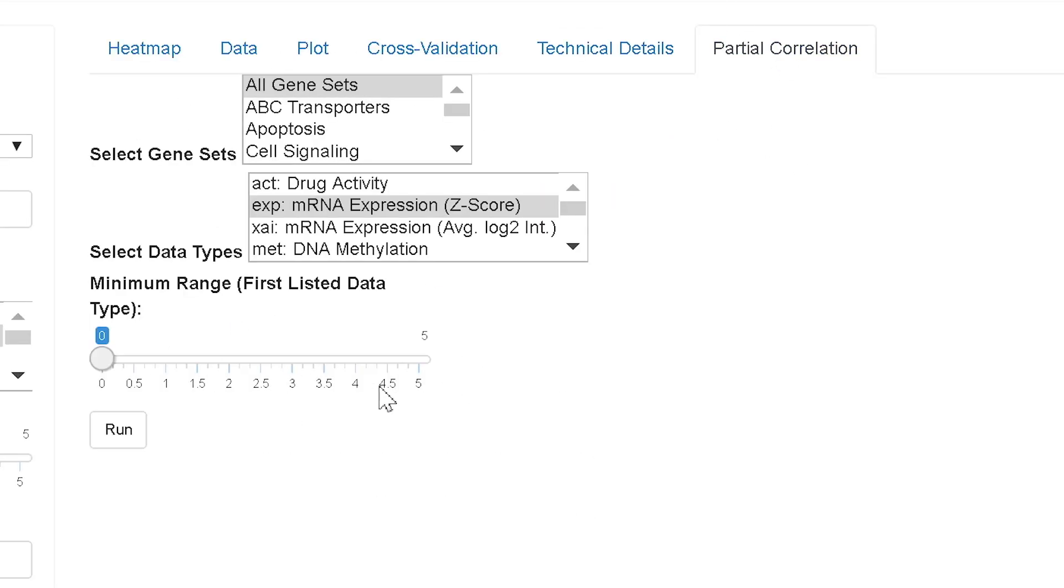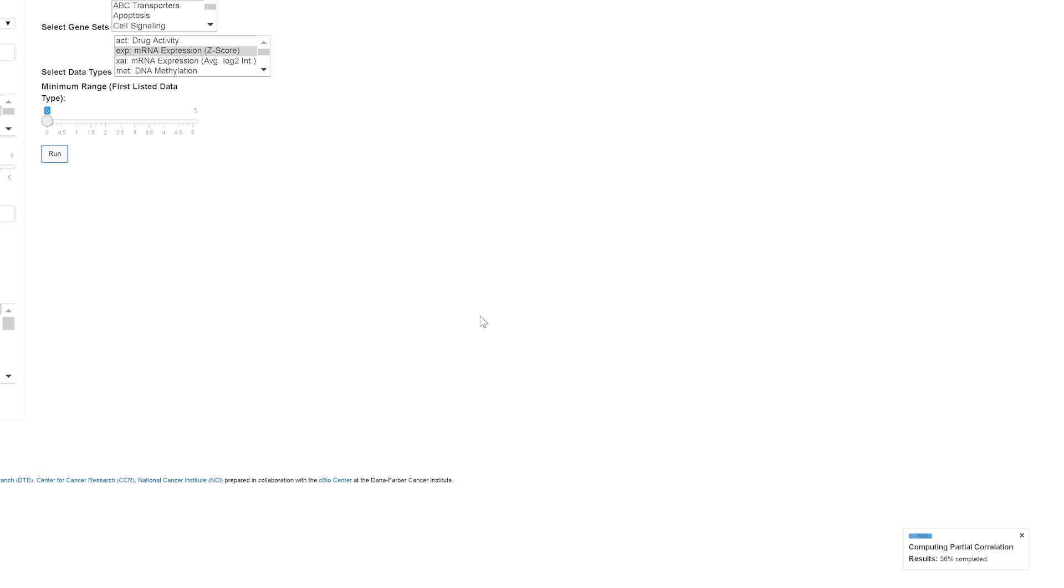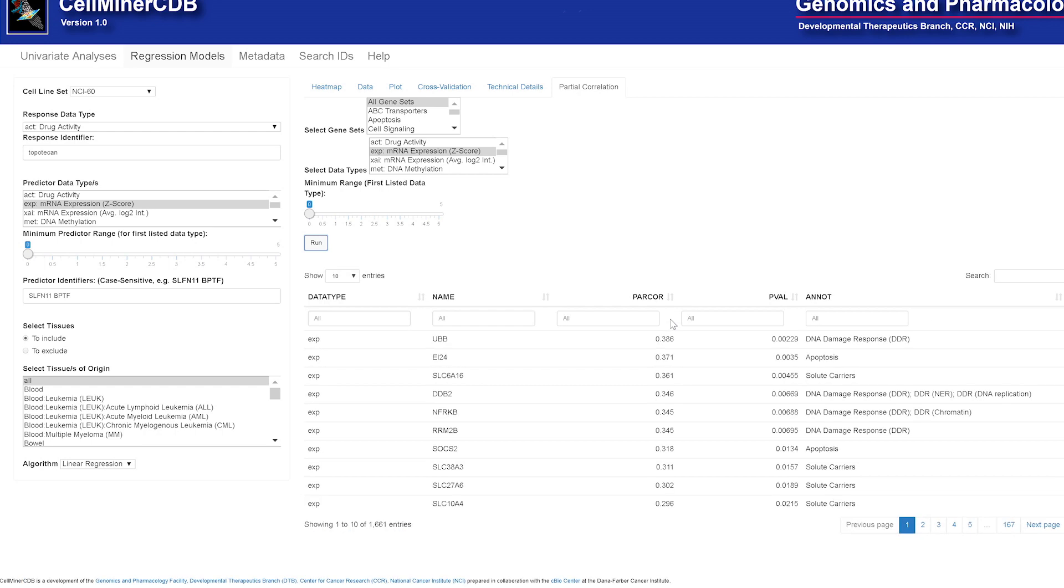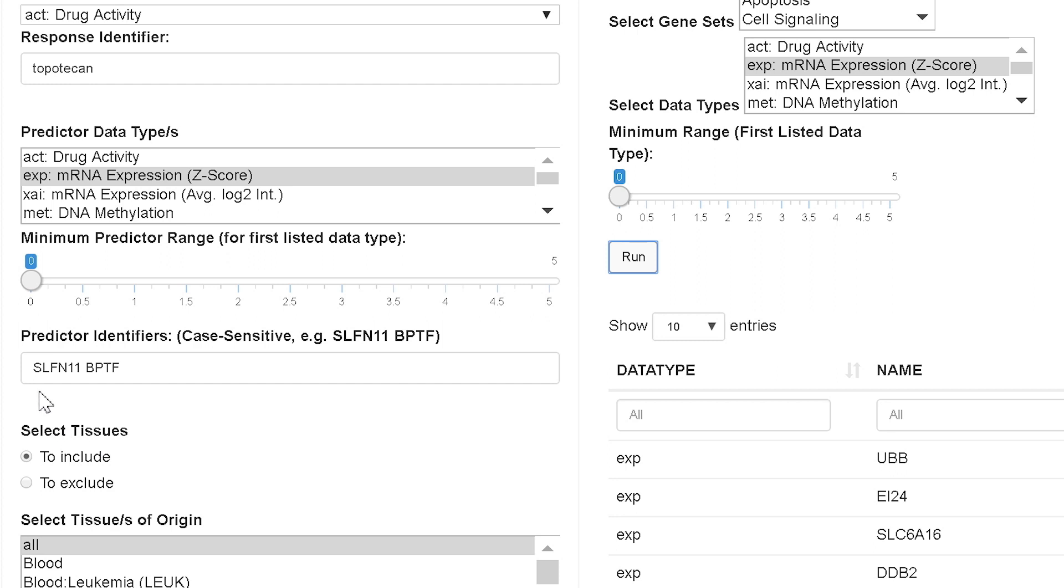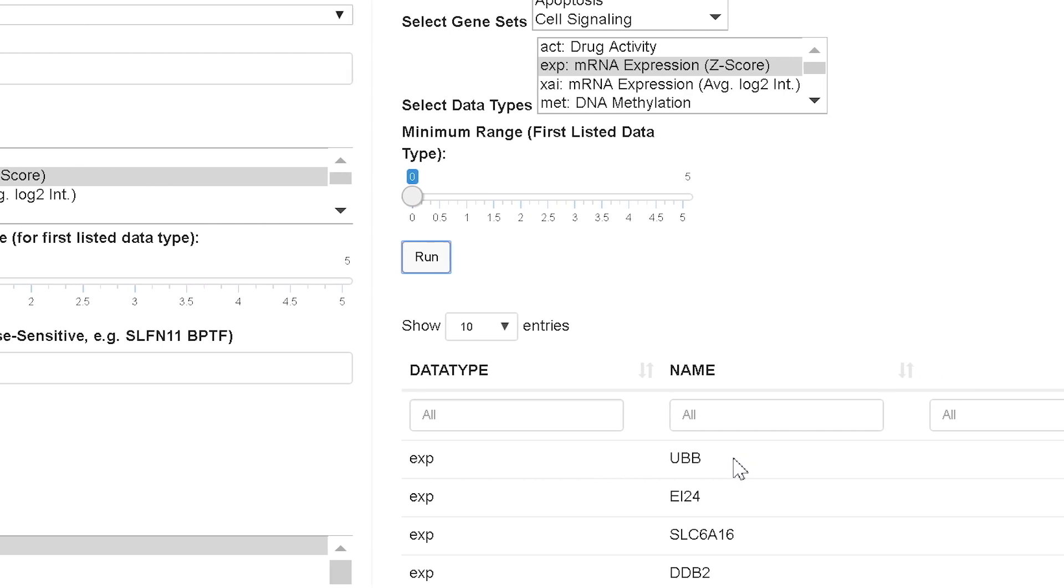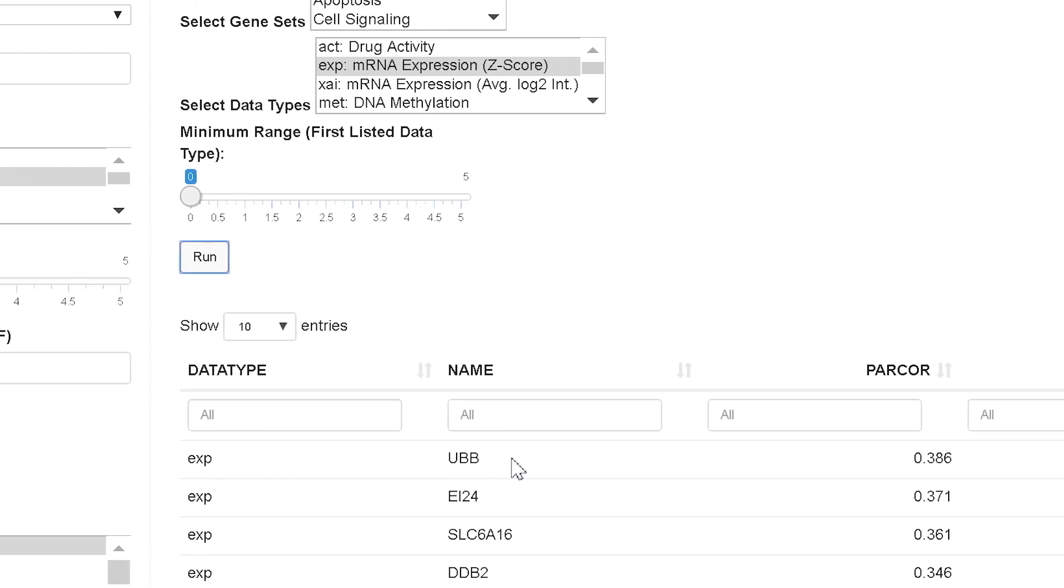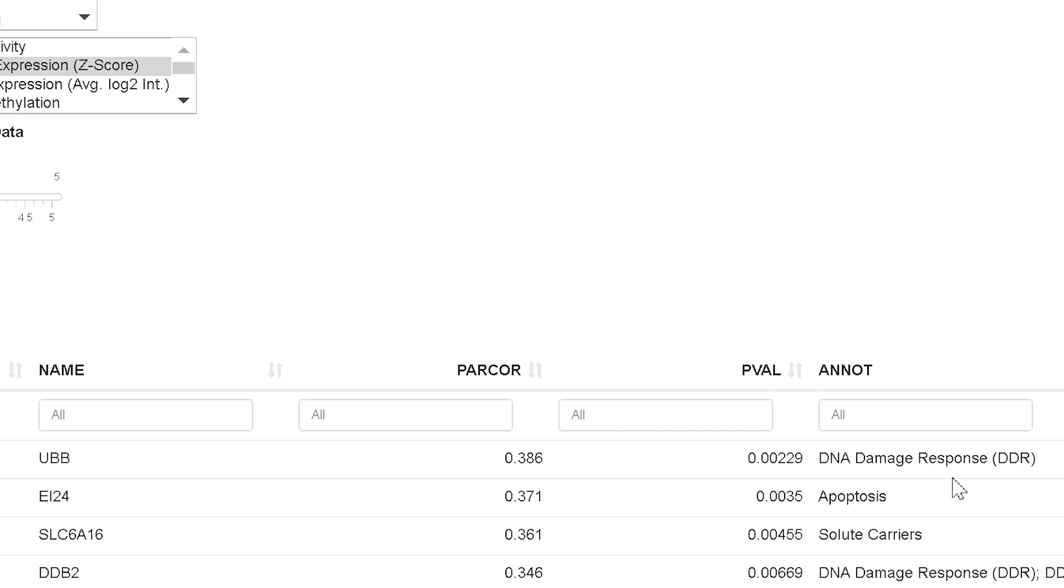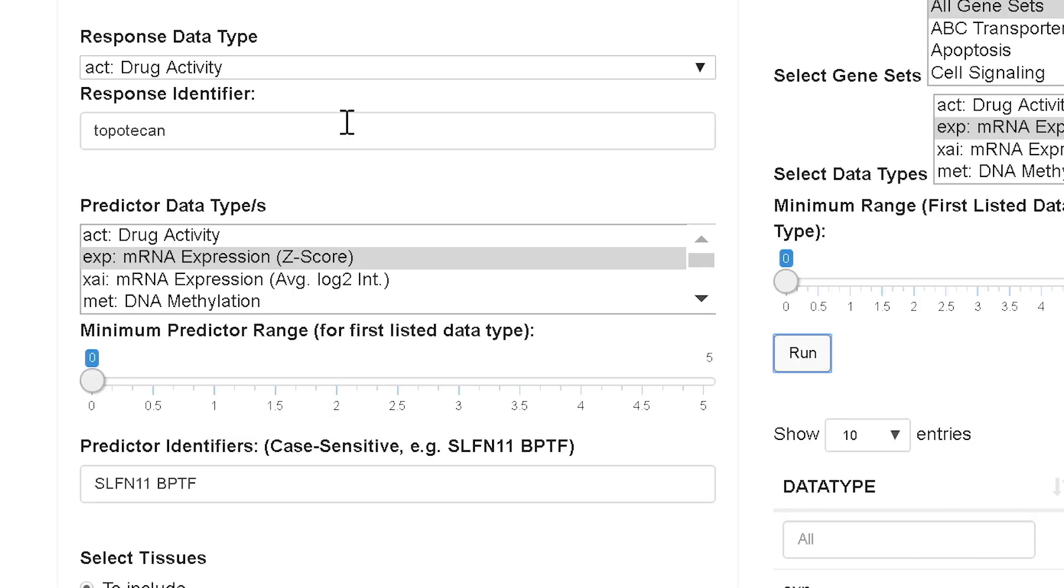Partial correlation functions by hitting this run button. I'll hit it so it'll be calculating. You'll see it's calculating down here on the bottom right. What this does is calculates the highest correlated predictors once the effect of the previous selected predictors are removed. That is to say, in this case we have Schlafen 11 and BPTF. Once the effect of these two are taken out, the question is, what gene has the next strongest effect on the topotecan activity. And you'll see in this case, it's brought up a gene called UBB, which is a DNA damage response gene. Well, that makes a lot of sense because topotecan is a DNA damage drug.